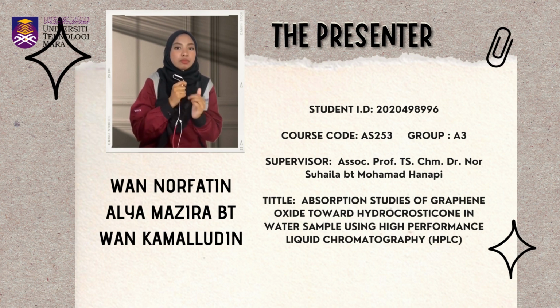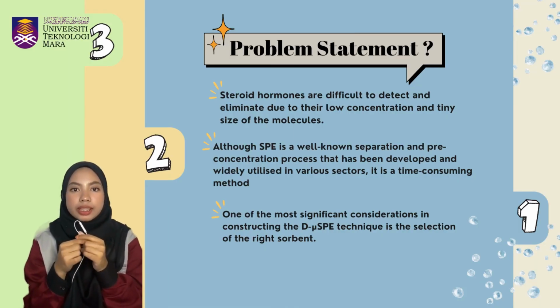The title of my project is Absorption Studies of Graphene Oxide towards Hydrocortisone in Water Sample using High Performance Liquid Chromatography (HPLC). There are three problem statements in this study.